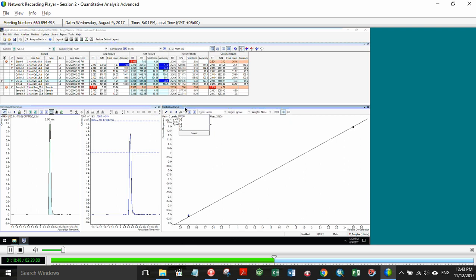So this is a nice way to be able to focus on different points without trying to manually zoom in. And, of course, as with most MassHunter applications, we've always got our full zoom back out button there, okay. Again, lots of ways to get back to defaults and get out of anything that was done either on purpose or inadvertently.